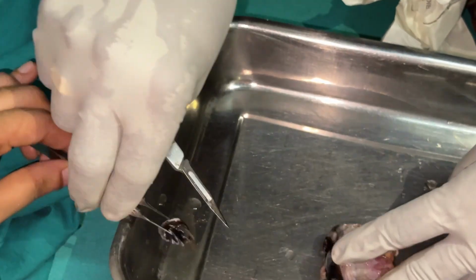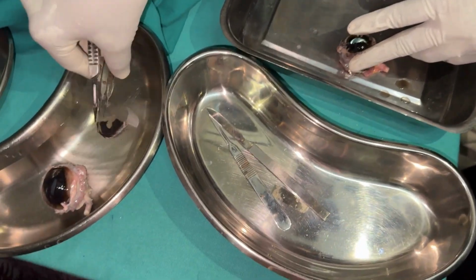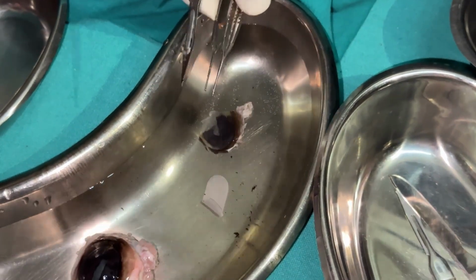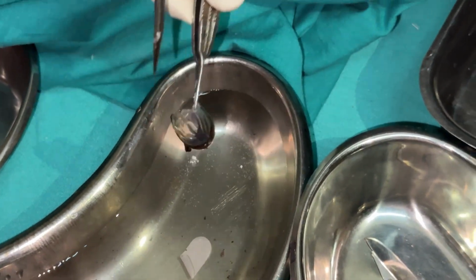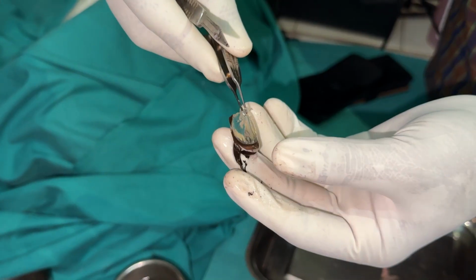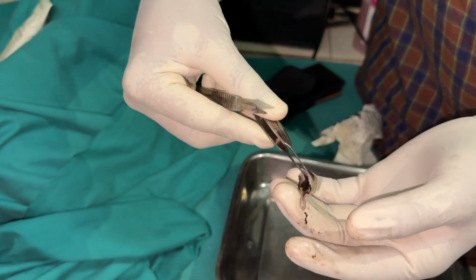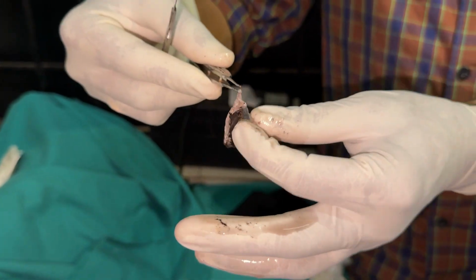We have removed the cornea. You see that? Iris is there. You see the transparent cornea now? The transparent cornea. Understood? This is a transparent cornea. It's a delicate membrane. And behind that, our iris muscle is there. The transparent cornea.